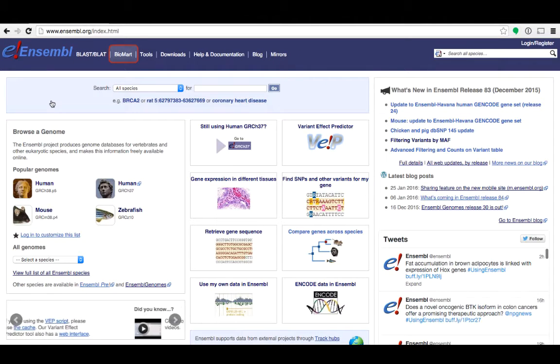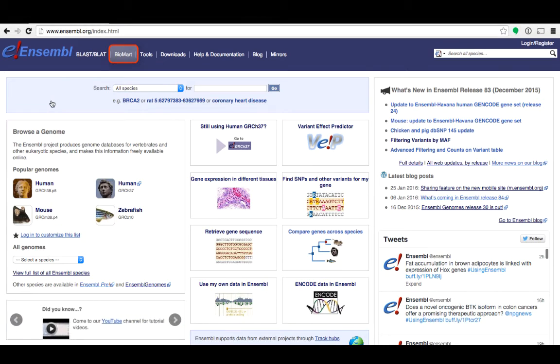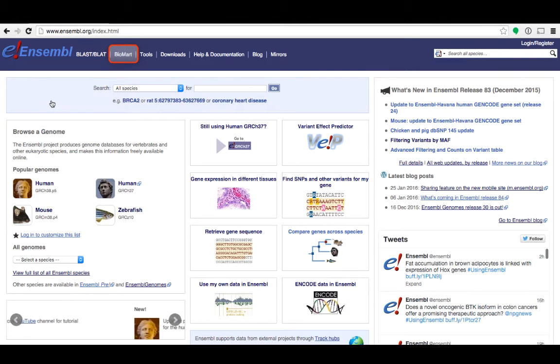You can find Biomart on the top navigation panel of the Ensembl homepage at Ensembl.org.